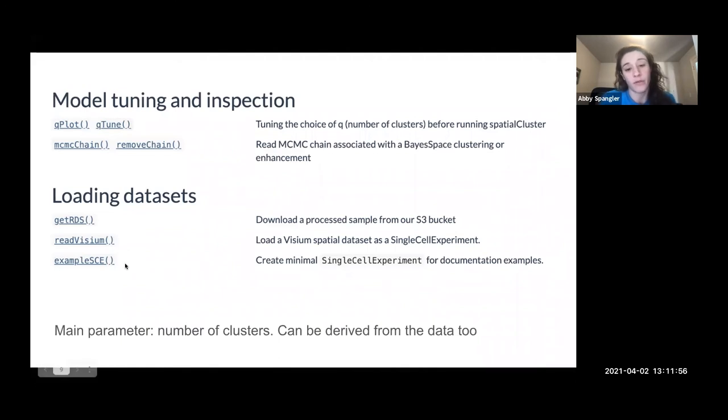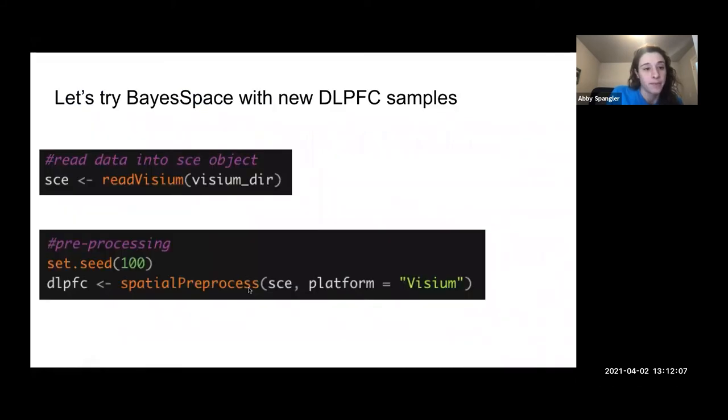They also have three different useful functions for loading the data into BaySpace. And the one that I've been using is this ReadVisium, which is super handy. So I'm going to walk you through the analysis that I did on my DLPFC samples. And then I'll show you some snippets of the vignette from BaySpace, which is actually from a different plot. They use a spatial transcriptomics platform, whereas all of our data is Visium data. You use their super handy functions to just read your Visium data in, and this reads data that comes directly from the direct output of Space Ranger, and it turns it into an SC object very easily. So that's cool.